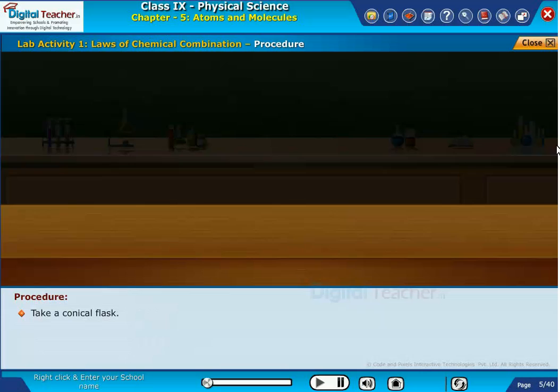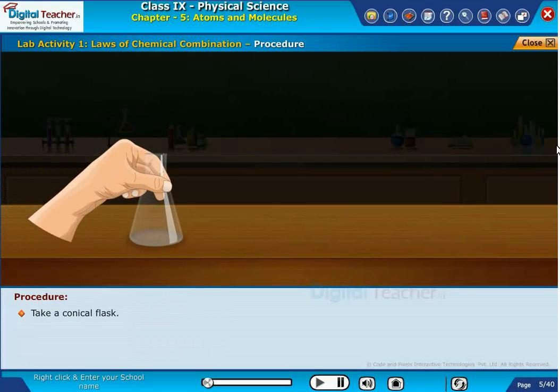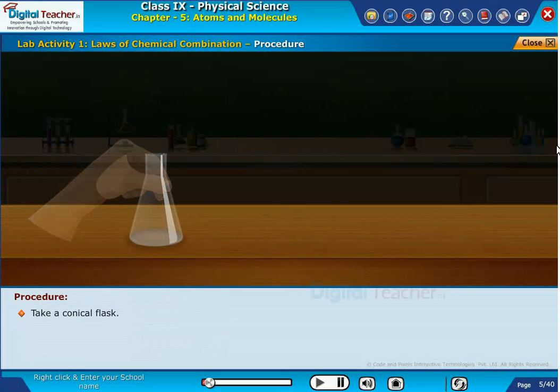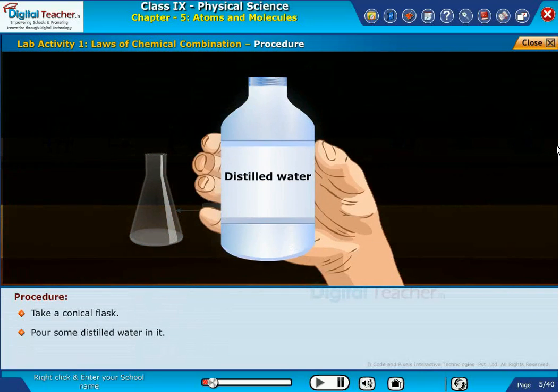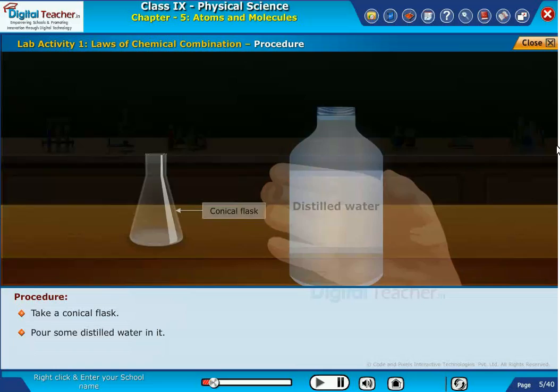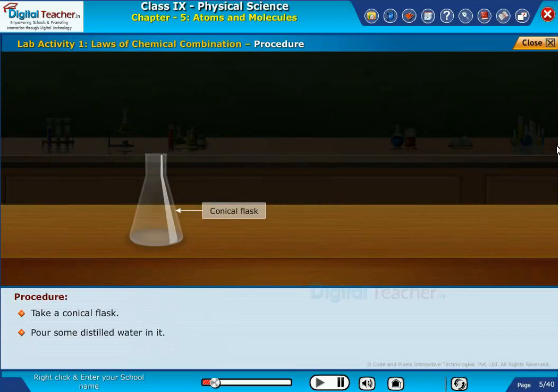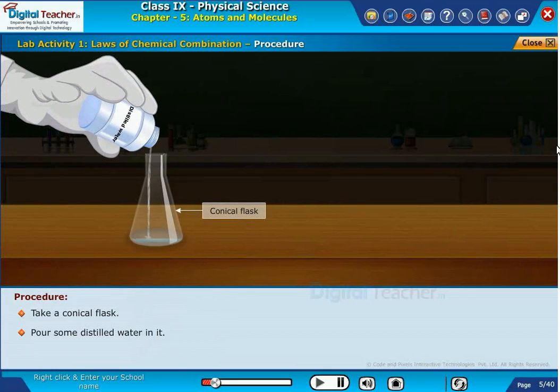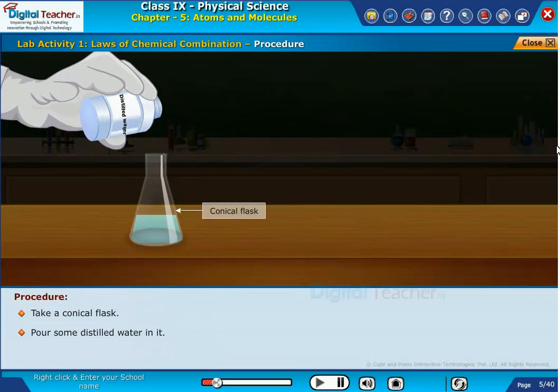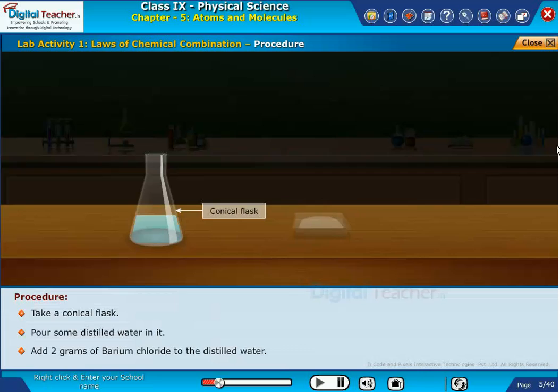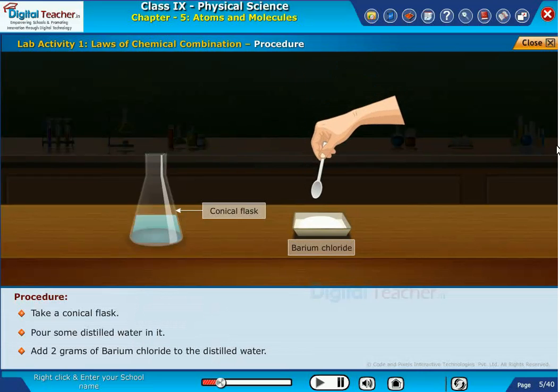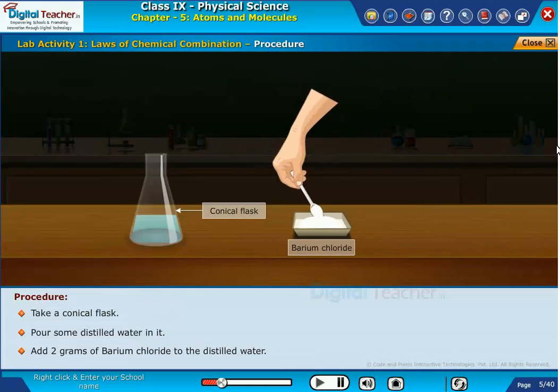Take a conical flask and pour some distilled water in it. Add 2 grams of barium chloride to the distilled water.